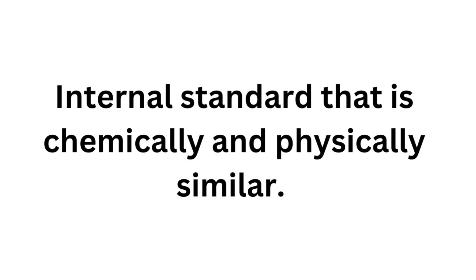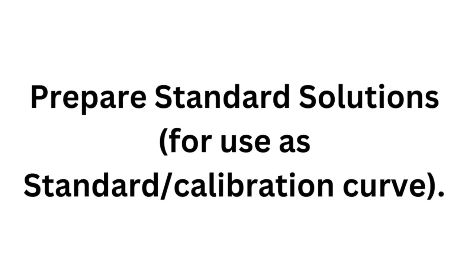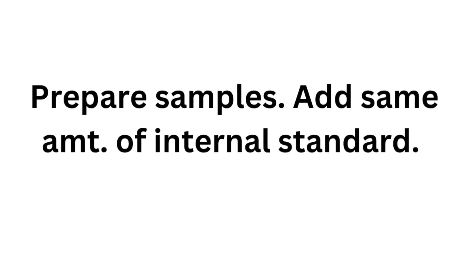The second is the preparation of standard solutions. You prepare a series of standard solutions with known concentrations of the analyte. You add a constant amount of the internal standard to each of these solutions. The third step is your sample preparation. So you've done your standard solutions, now you're doing the samples.